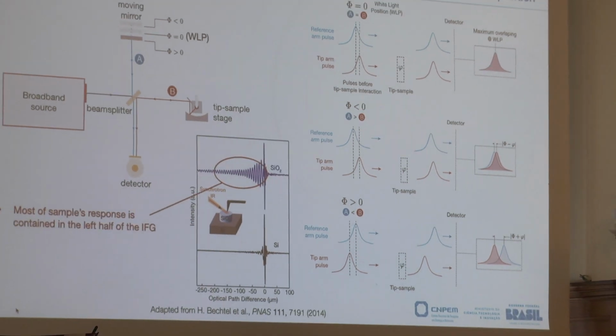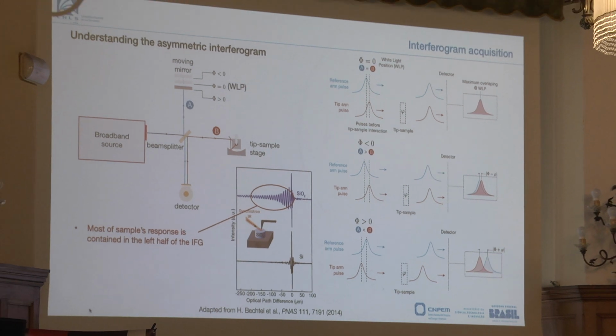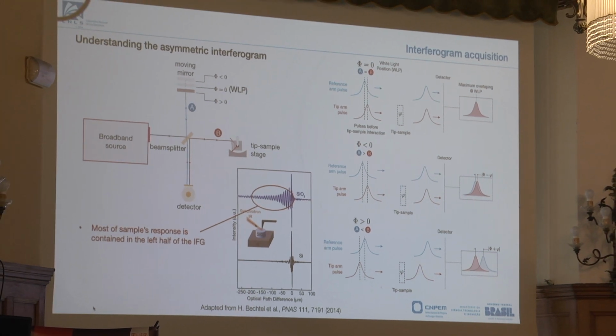So this is an example of a synchrotron nano-FTIR spectrum on silicon dioxide. And you can see all these SPP oscillations here on just one side. And the other one is very sharp. Looks like the reference, right, at the silicon on this side.